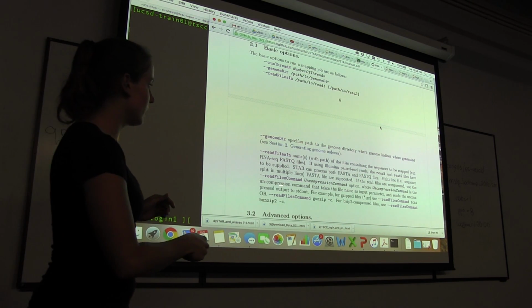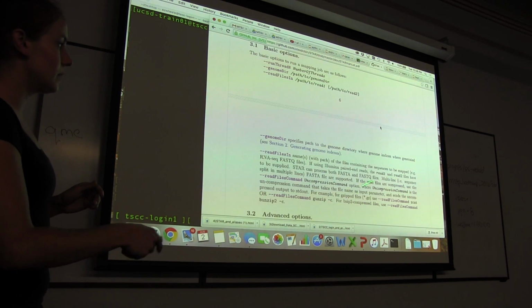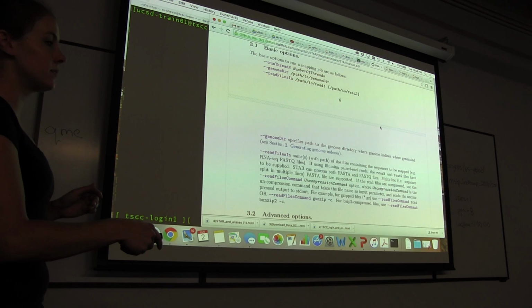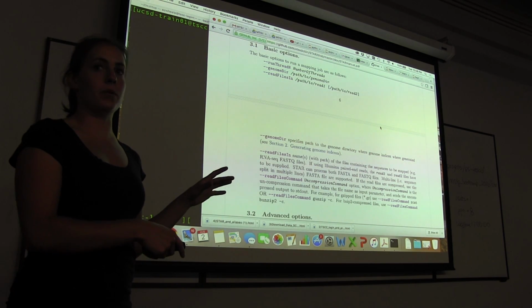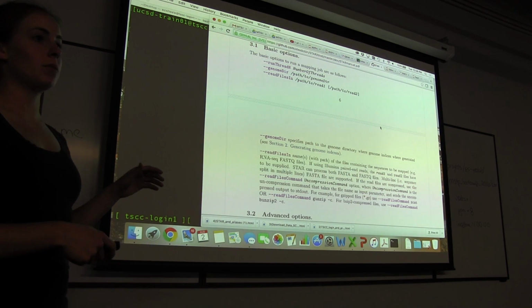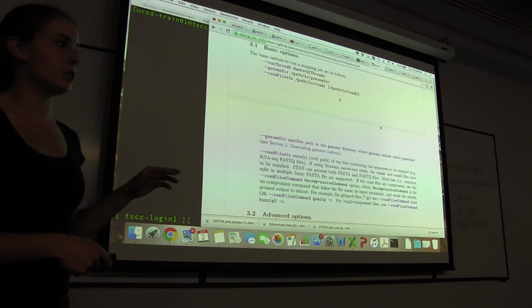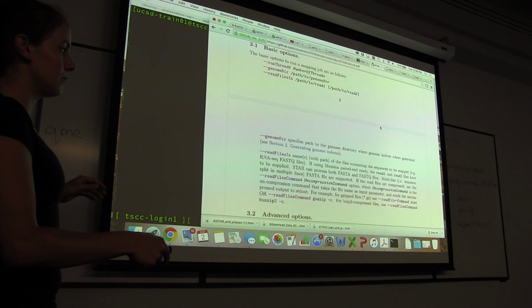Okay. So the other thing you need, it tells you in here about if files are compressed. You're going to have to specify that in your flags so that it knows how to read it properly. Because we're using files that are compressed, they have that .gz extension. It tells you right here. For example, gzip files use the --readFilesCommand followed by zcat.